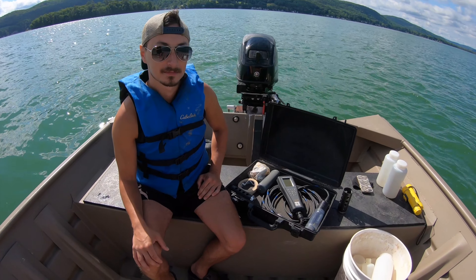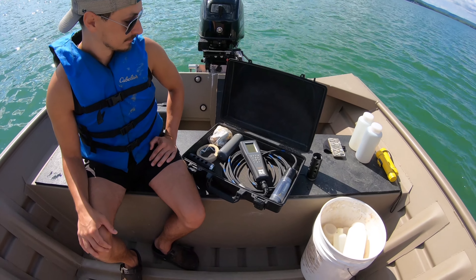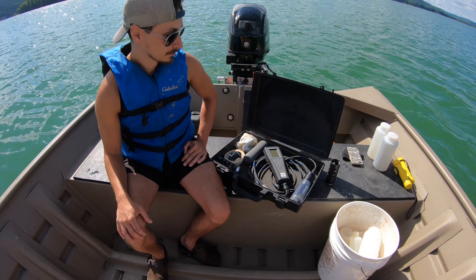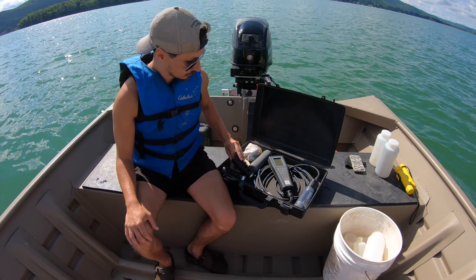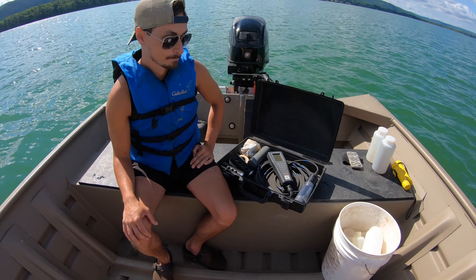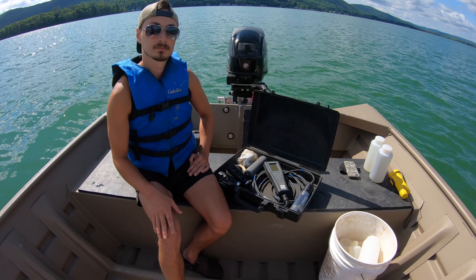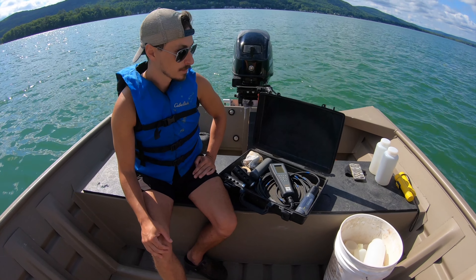Our next part is using our YSI water quality instrument — Yellow Springs Instrument. It's used to monitor temperature, dissolved oxygen, salinity, conductivity, pH, and TDS. We're going to go from the surface to the bottom, every one to two feet depending on what we see. We're going to check if there's a thermocline or if it's still mixing.